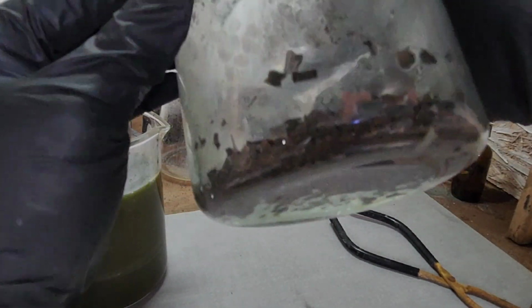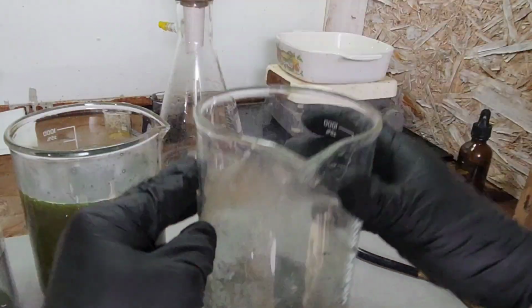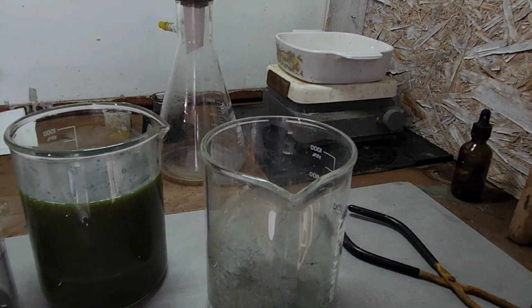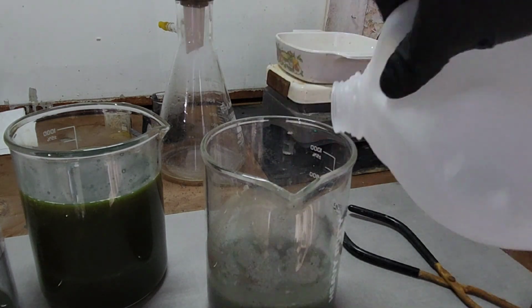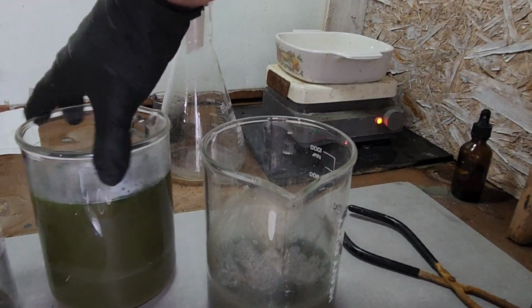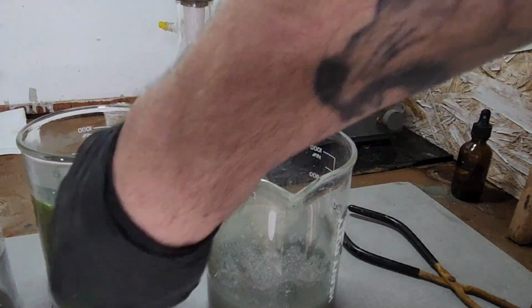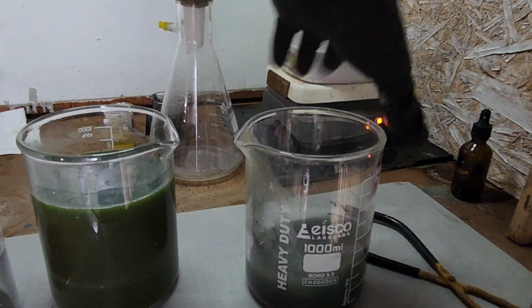Just a whole bunch of copper, it looks like. Well, let's keep at it. It'd be interesting to see if there's leftover sulfuric in what I just poured out, and if that does anything to the rest of that. Let's see.